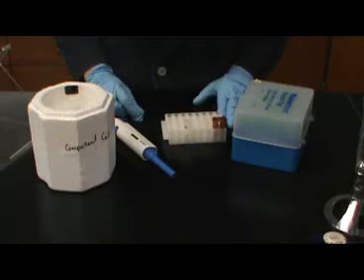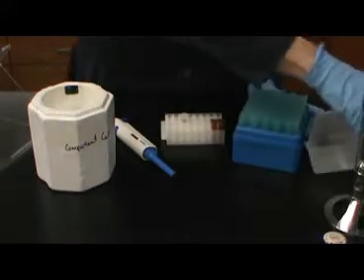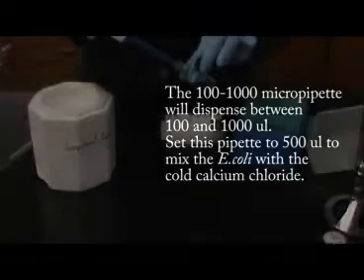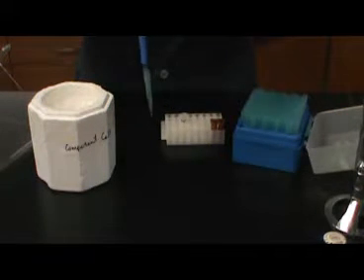Once the plasmid and water have been added to your microcentrifuge tubes, the tubes should be kept on ice at your lab station. Transformation of bacteria, although easy to complete, does require several steps. The first step is to make the E. coli cells competent. This is done using the 100 to 1000 micropipette, which dispenses between 100 and 1000 microliters. You will need to set the micropipette to 500 microliters. Add 500 microliters of cold calcium chloride to the tube labeled E. coli.